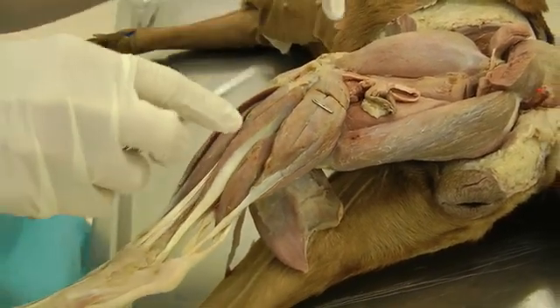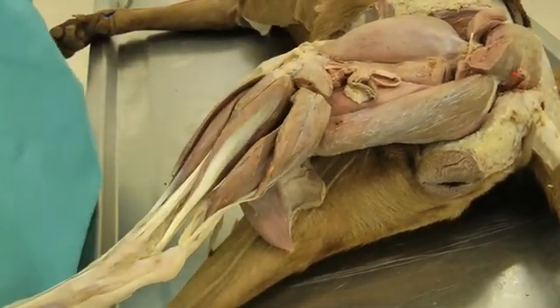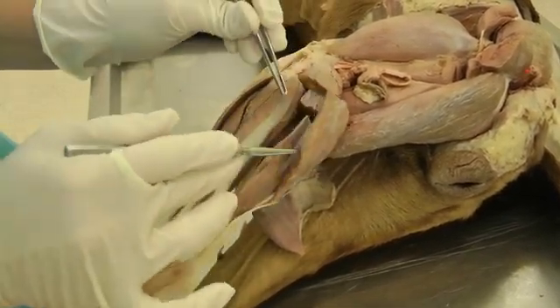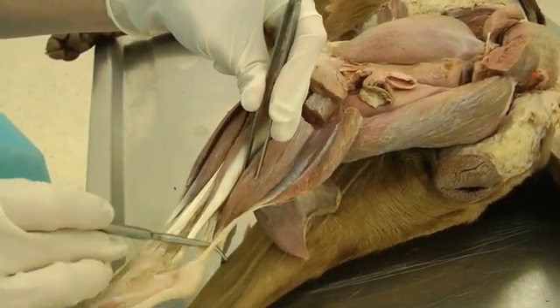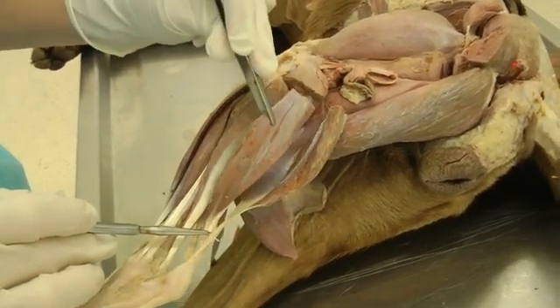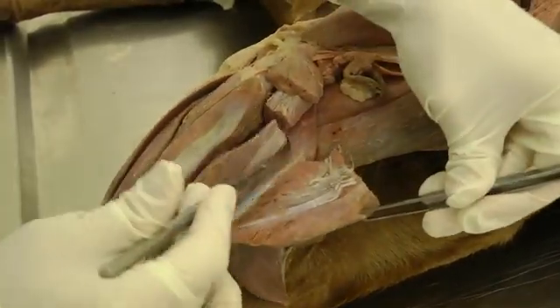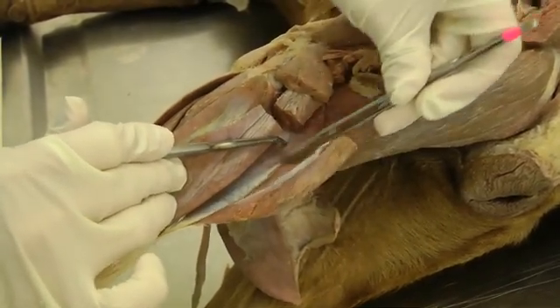On the lateral side you'll dissect out your gastrocnemius heads and transect. I usually only transect the lateral side, but you can transect both if needed. I transect the lateral head and peel it back, going from the tendon down and peeling it away from the lateral head of gastroc. This is the superficial digital flexor in between those two heads. This is the lateral head of gastrocnemius and this over here is the medial head.